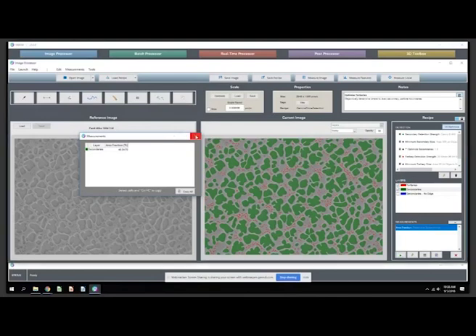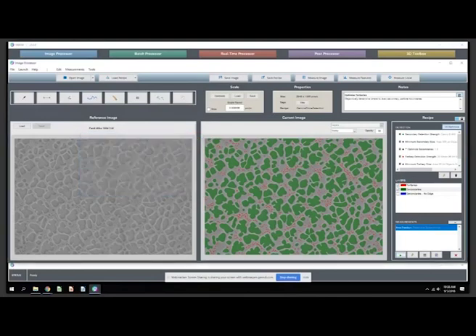And it looks like we've hit the 5-minute mark. So let me just touch real quickly on a question if there was any validation of the segmentation result. And yes, let me re-mention how in NASA's paper they discuss how they took the results of our objective segmentation and compared it to a phase extraction plus mass spectroscopy technique, basically wet chemistry.